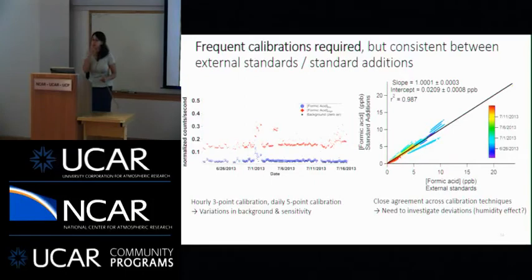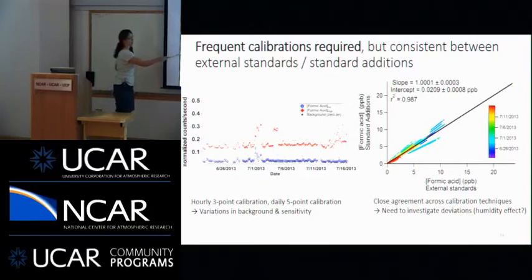The bottom line is, I'm not going to go through the excessive amount of data we collected. It turns out that these really frequent calibrations were not actually my assistant professor paranoia. They were actually required. In particular, the background of the instrument, which is in black here, is a function of time for the entire time we were measuring at SOAS. You can see that the black trace along the bottom of this figure actually moves, and it moves by a non-trivial amount. This is normalized counts per second. That wiggle is important. It's the background we're subtracting, and that changes.